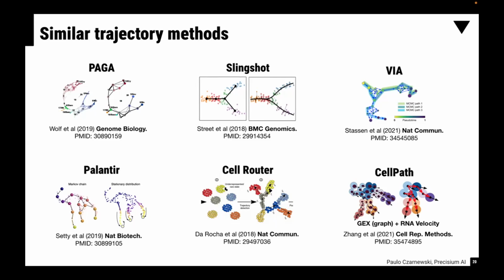Yeah, so that is also an indicator. Of course, the UMAP is not what I would advise to run trajectory on. You will run trajectory on the raw space, and that's why not using the UMAP or the TSNE that much. But they do provide, as you're mentioning, some guidance that maybe these cells shouldn't be put together, right? It's really an investigative approach. You always need to check and see, because you can basically fit anything into trajectories if you want.